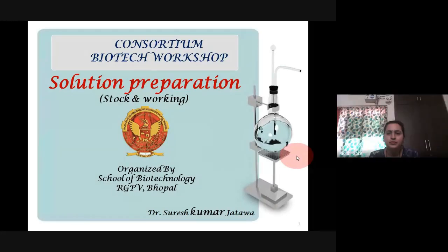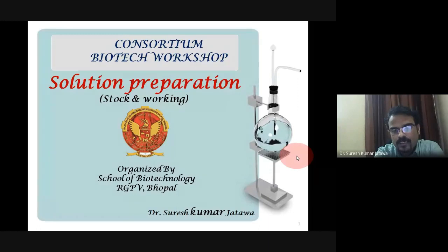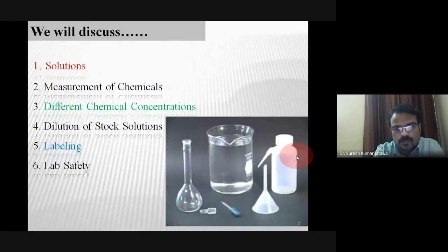So, as we know, solutions are very important component of the lab when we are performing any type of experiment. The preparation of solution accurately will always enhance the chances of success of your experiment. Today we will discuss the solutions, that is stock and working, measurement of chemicals, different chemical concentrations, dilution of stock solutions, labeling, and lab safety. All these contents will be covered during the entire session.